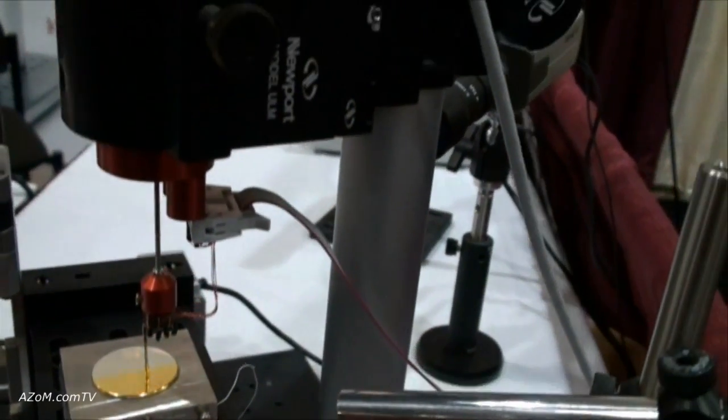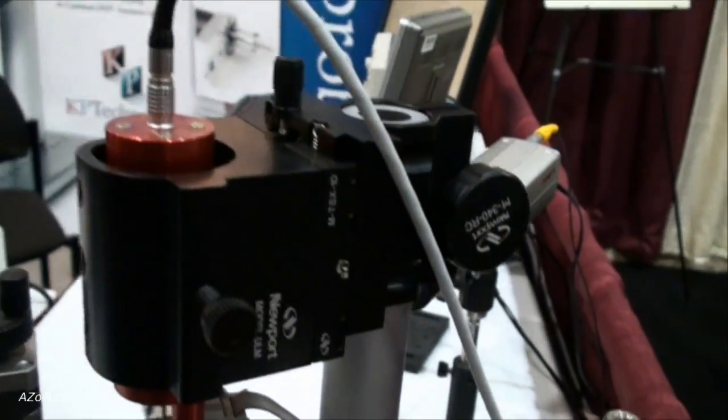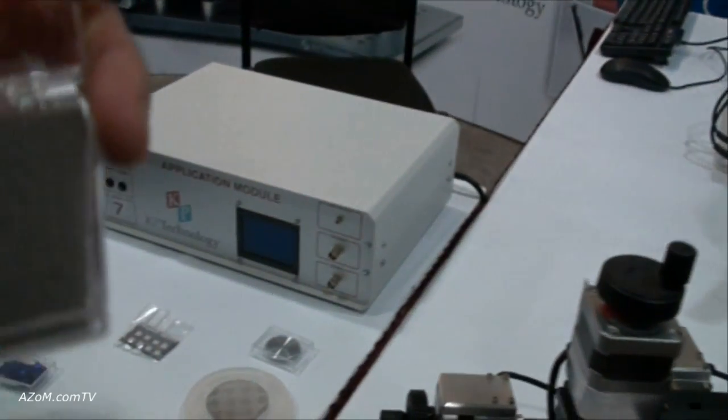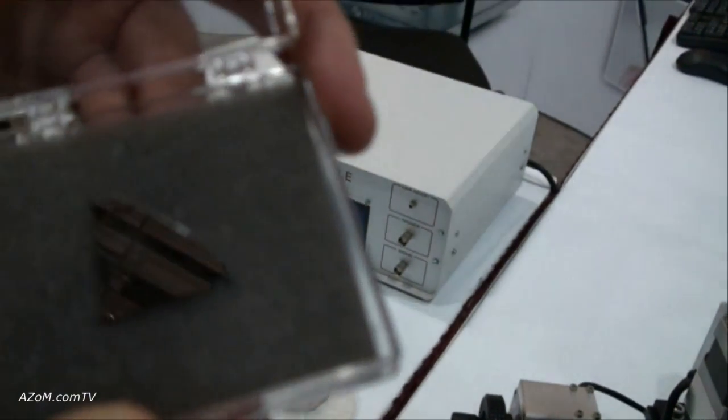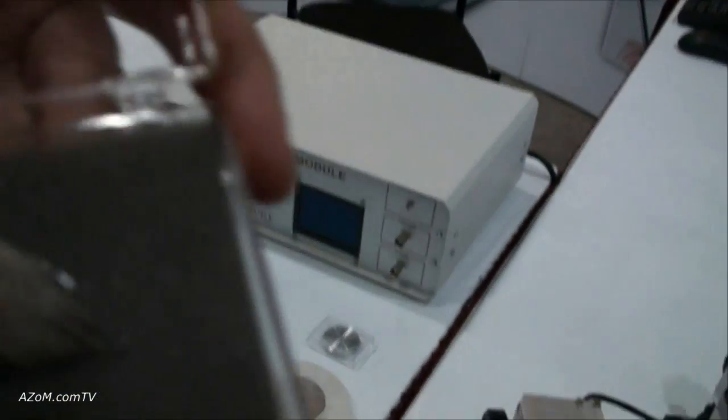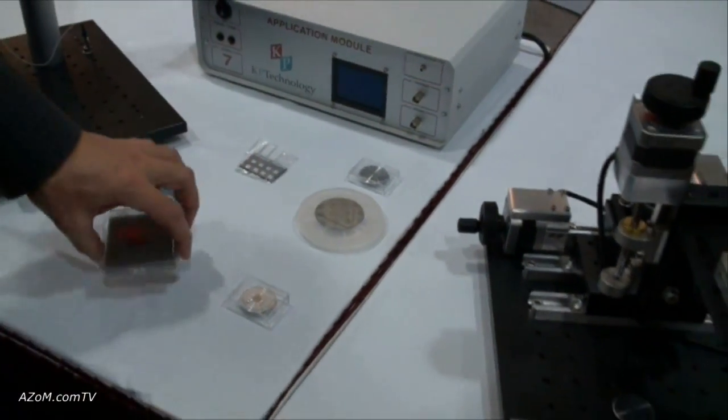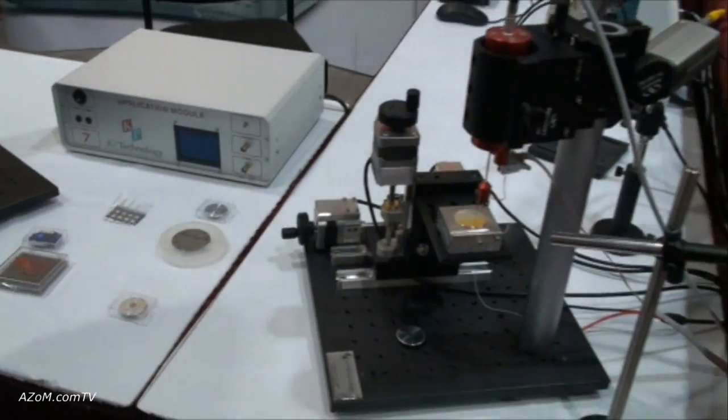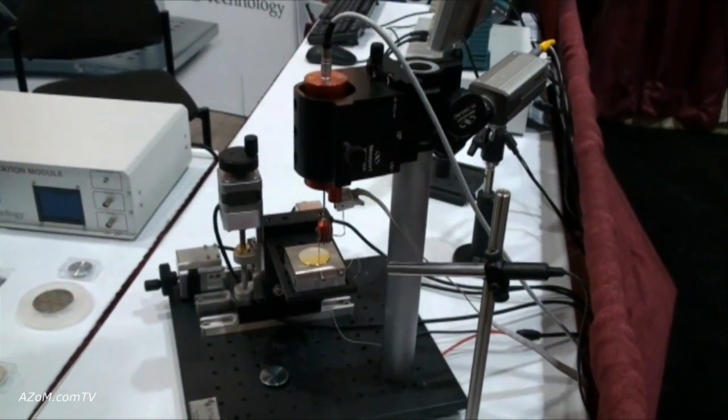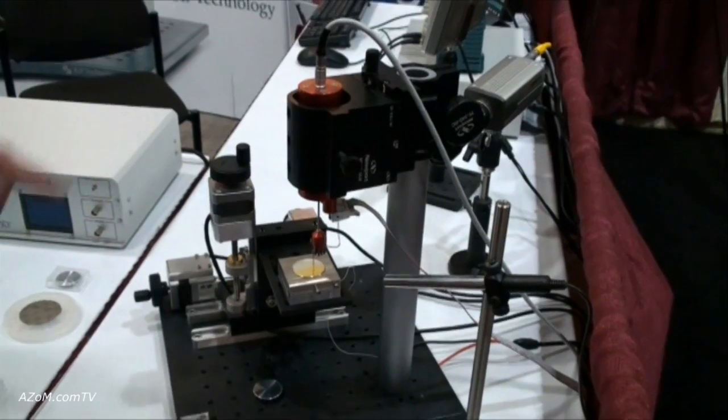It can detect films as small as one molecule, so I'm just going to show you a molecular film. You can see the pattern just disappearing because of the surface tension. That was very quick, but that's a film that's one molecule high. That will give a work function difference of about 350 millivolts, and our resolution is 1 to 3 millivolts.